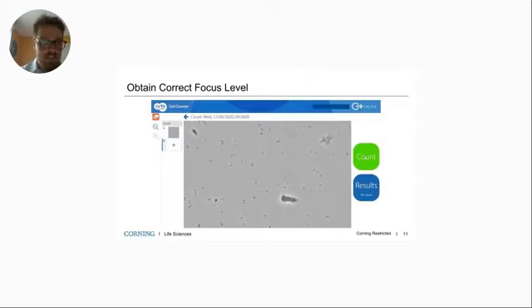And I see Jeff has picked version 3 of the algorithm. And that's one of the main differences of the algorithms: with the old version of the algorithm, there was only one count, and then your results would pop up. Now, with version 3 of the software, we have this multi-count feature. So we can end up counting up to 8 times, and that is going to go ahead and average those results for you.